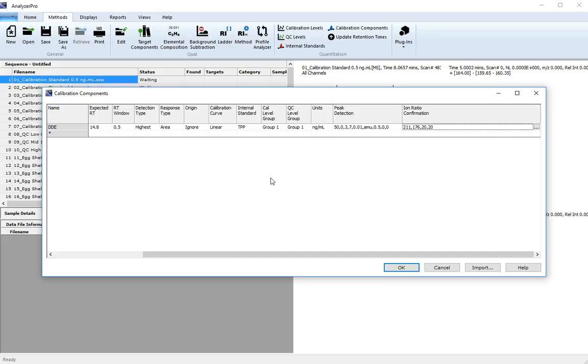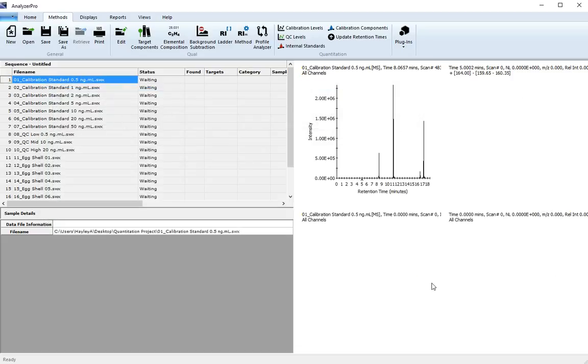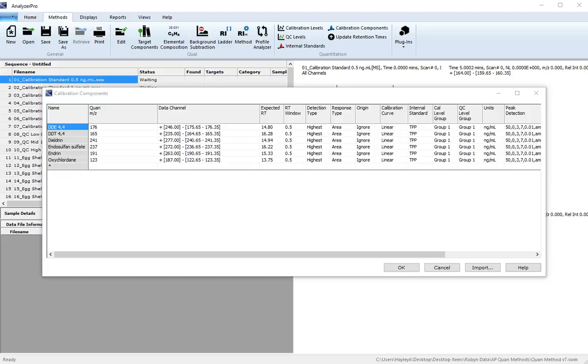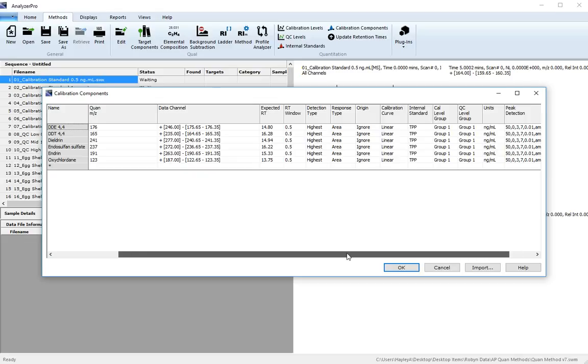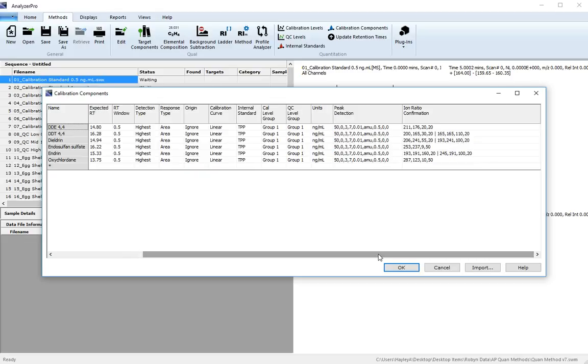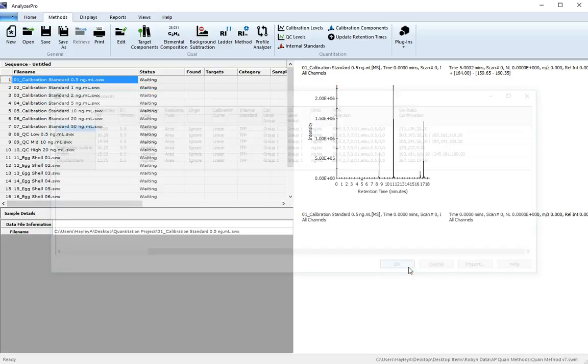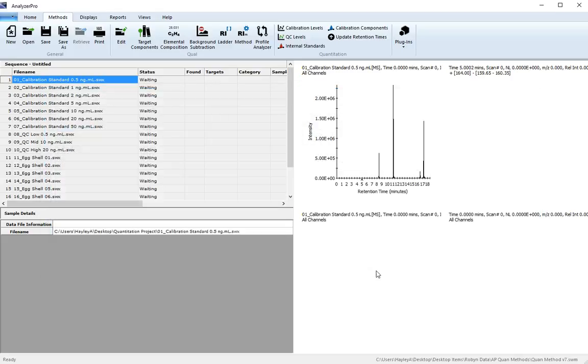Now continue to populate the calibration components table using the information from the tutorial booklet which is available online. Once your calibration components table is complete, it should look like this. Click OK and remember to save your method.